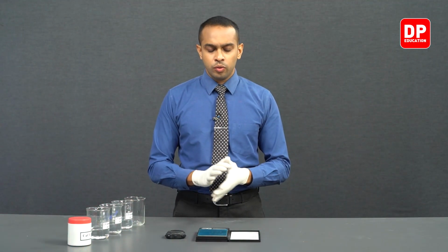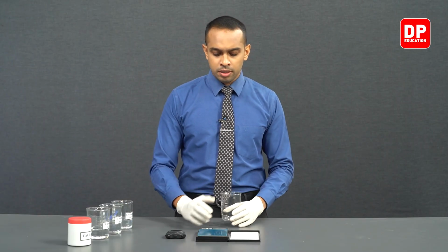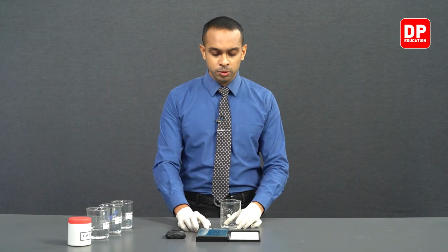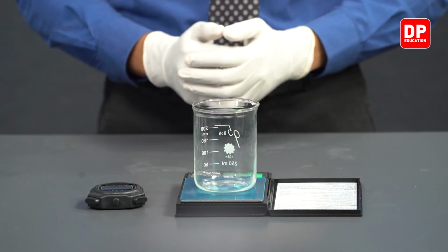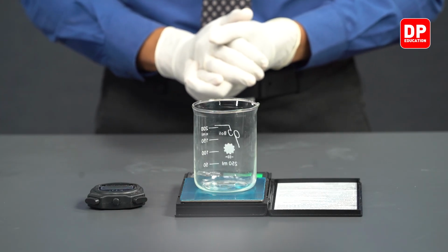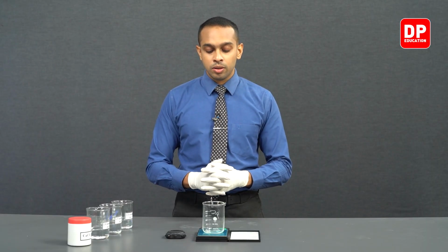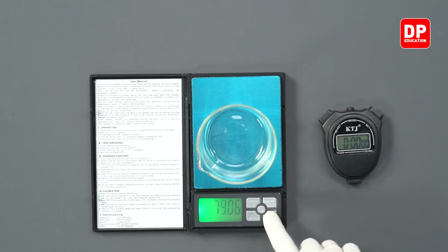Now students, we are first going to take a clean, empty beaker and weigh its mass. Before doing so, let's turn on our digital balance. Make sure the unit is in grams, and then we'll place this beaker over here. The mass of the beaker is 79.06 grams, and we are going to be measuring 100 grams of calcium carbonate into this. To make it easier for us, we can use the tare function.